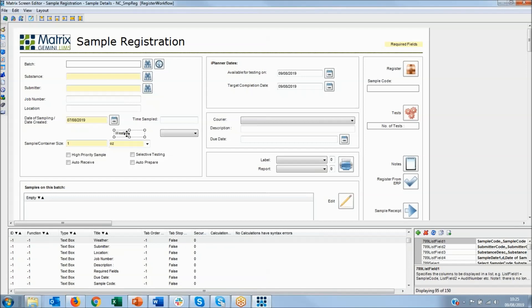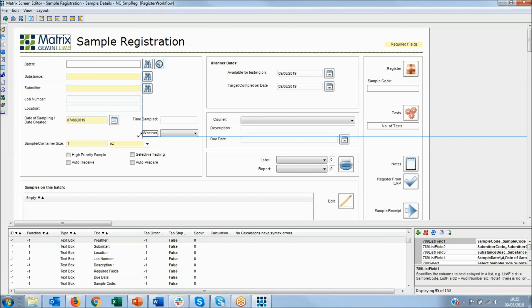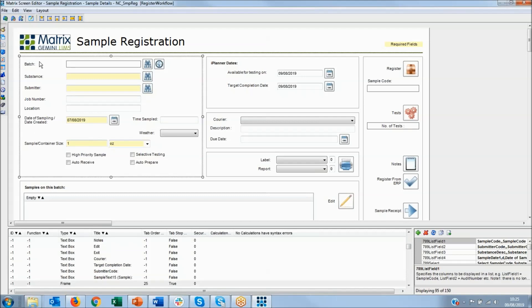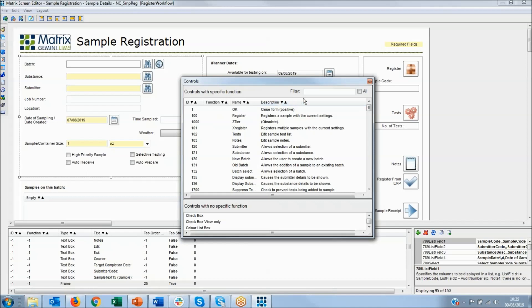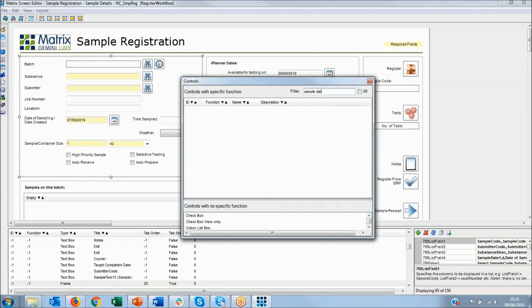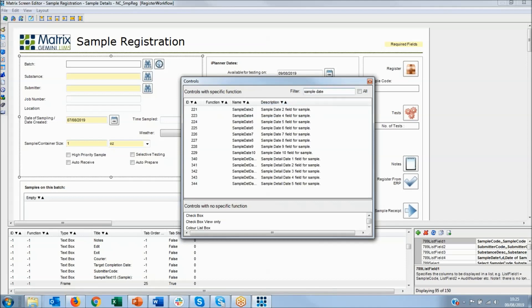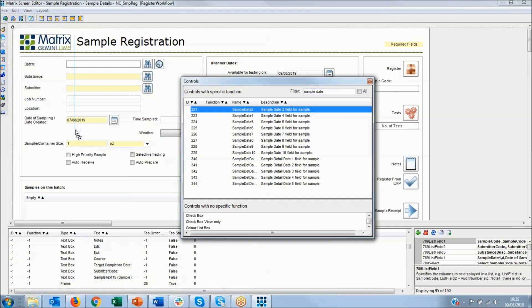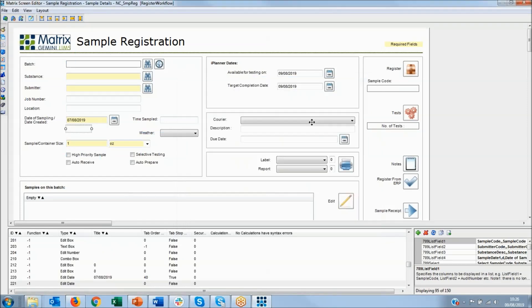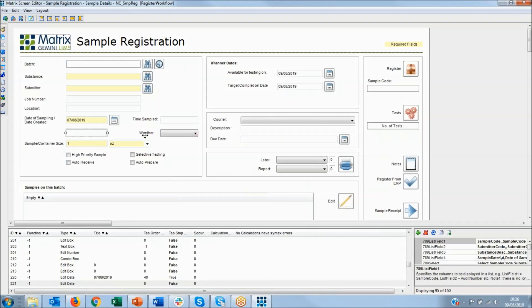So I'll line that up here. Line this up here. We could do it like this for instance. There we go. And then we'll make another date box in here. So this time I want to pick a sample date field. There we go. So I'll just pick one of those and put that in here. Something like this. You can give it a space between the two and line it up with the other box.